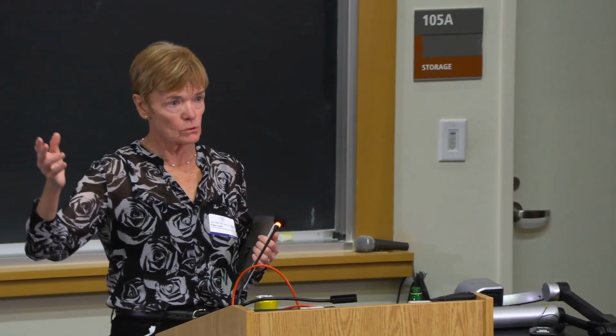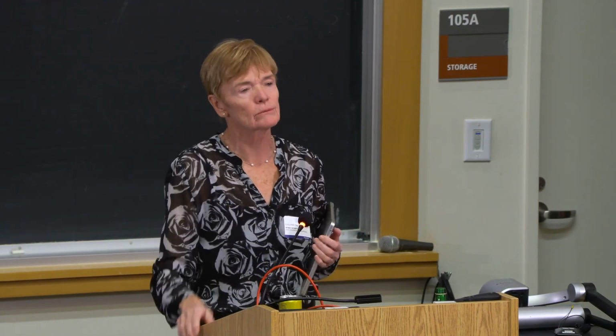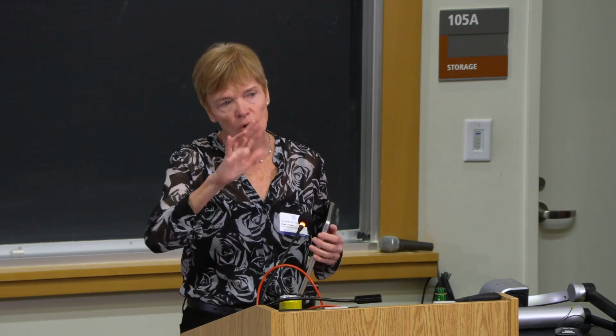And in the end, many of those particles were actually looked at one by one by eye, which we would never do in the real world, because if you have a few false positives, a few false negatives, who cares? You wash them out with the 2D class averages. But because it was a challenge, we felt we had to get as close as possible to real ground truth. So that's what we did. 3 months of work. But now these people are scoring quite well, and they only get 12 hours of GPU time on a pretty normal box. If they can do in 12 hours what took us 3 months, we will be thrilled.